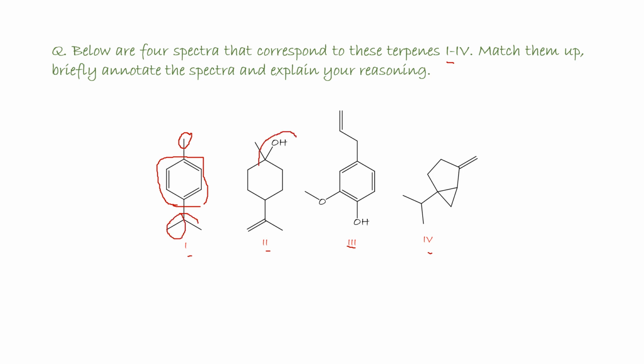Here we have OH, alkene, CH. Here we have alkene, aromatics, and OH. Here we have alkene and sp3 carbon H bond.